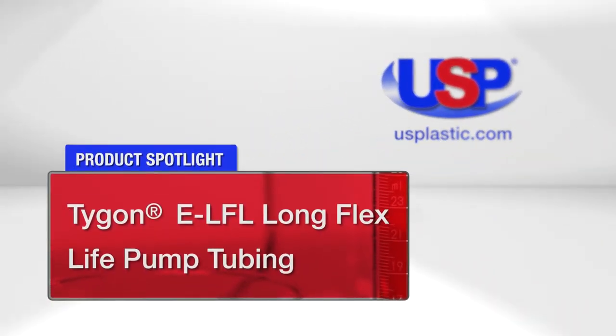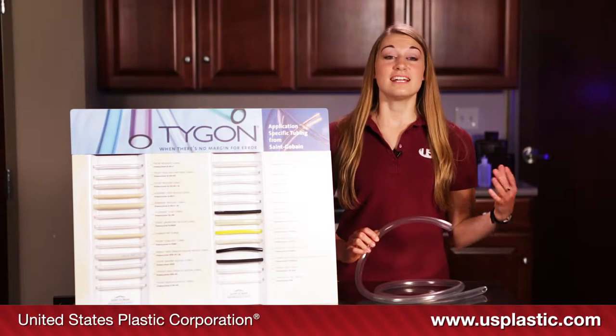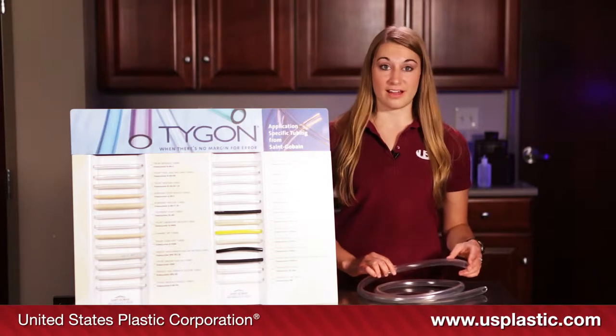Today's featured product is Tygon Long Flex Life Pump Tubing, also known as LFL Pump Tubing. It is specifically designed for use with peristaltic pump applications.